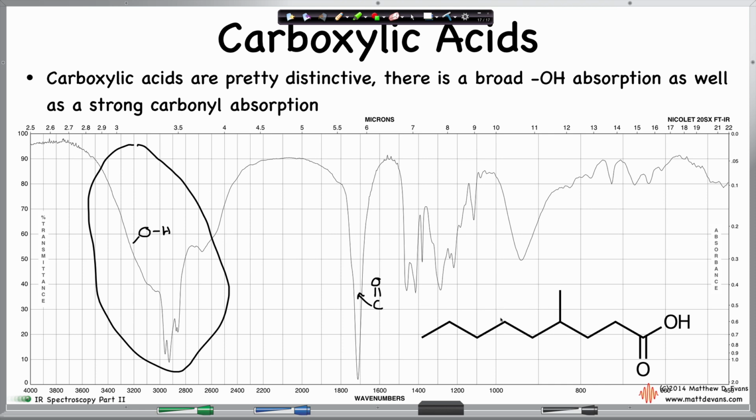And really when it comes to IR analysis, I'm not so much looking at the values as I'm looking at the patterns or the shape of these curves. And carboxylic acids jump out at me. They always look like this, a really broad absorption that starts about here and merges into the CH stretching here. And it has this kind of sloping feature right here, really sharp features here, and then it kind of fades off. It also has the carbonyl, got to have that. It's not a carboxylic acid unless you have this absorption too.